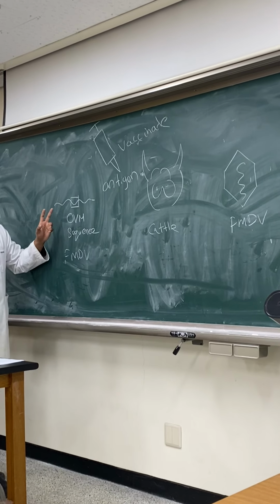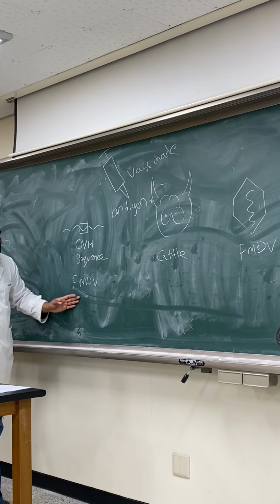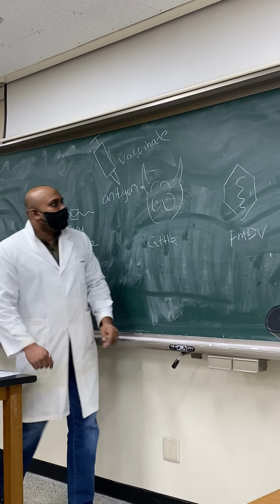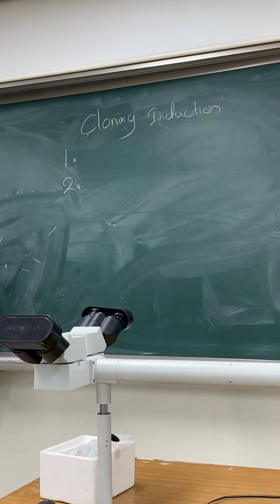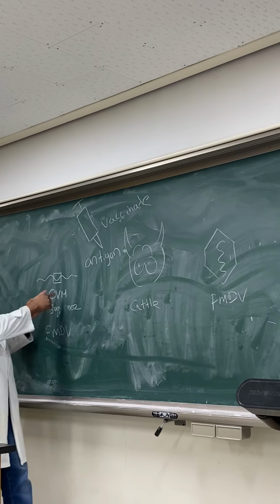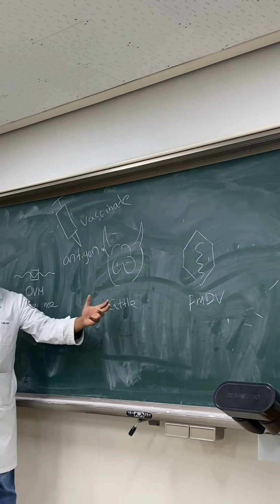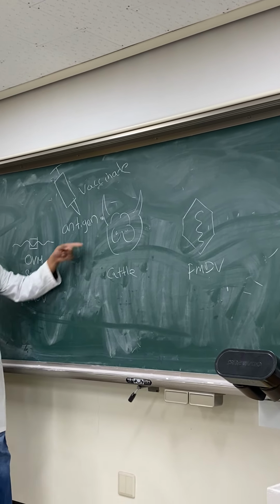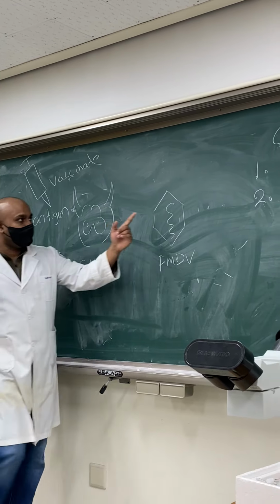So our lab has developed a specific sequence called OVM from the foot and mouth disease virus that can potentially induce an immune response. Right? To check this one, we need to satisfy two things. Once we inject this sequence, we don't know whether the OVM sequence produces a protein or not. So we want to confirm that once injected, this OVM produces a protein. That is the first objective.